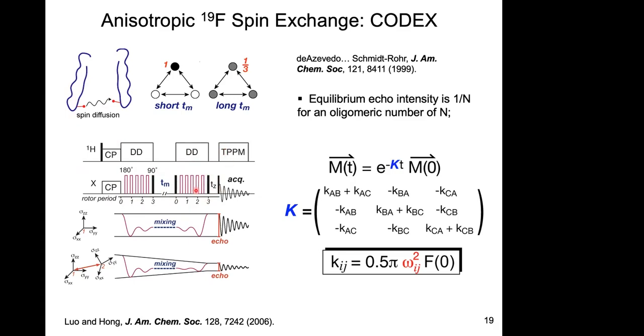And then after the second pi pulse train, you have another Z filter, a pair of 90-degree pulses, with TZ usually a much shorter mixing time. The reason for having a second longitudinal waiting period is to control T1 relaxation. Because as you wait 700 milliseconds or so to observe something, whether that's slow exchange rotation or spin diffusion, T1 relaxation is happening.